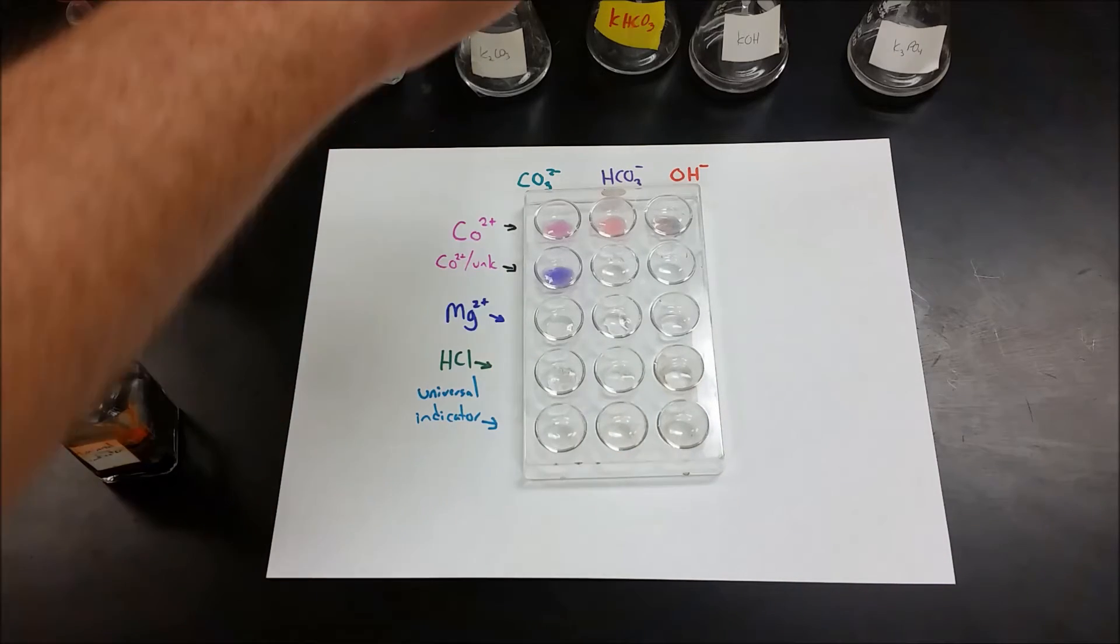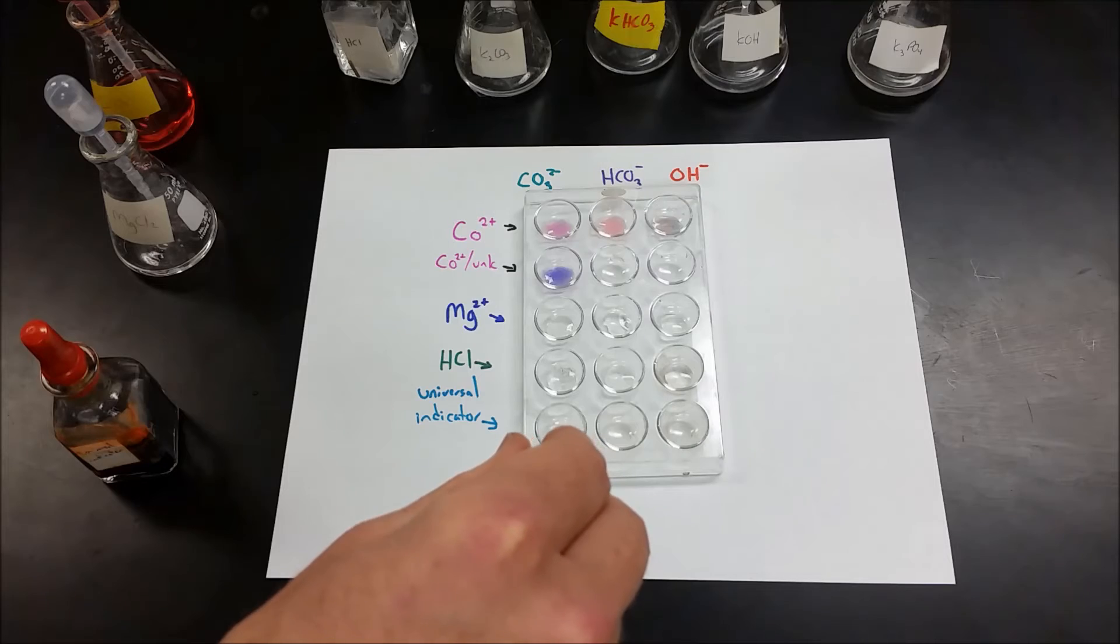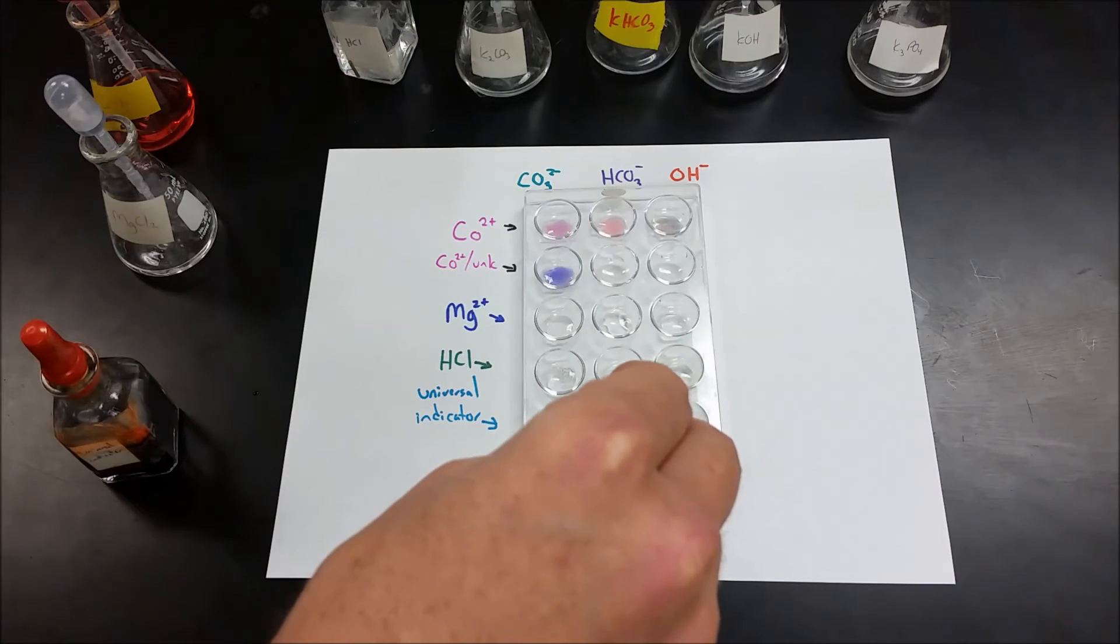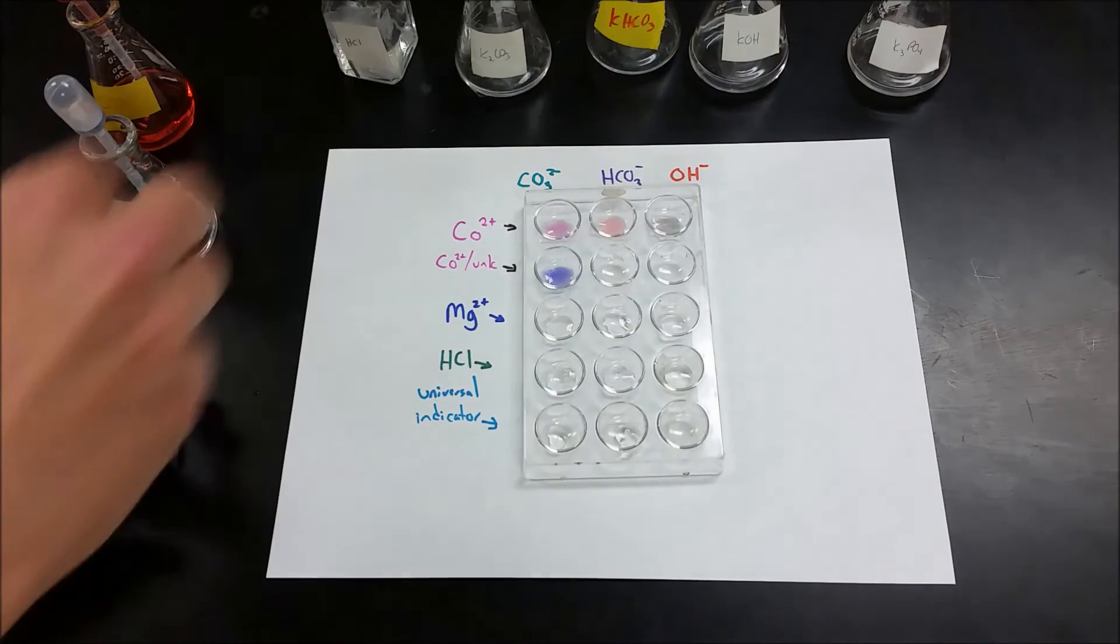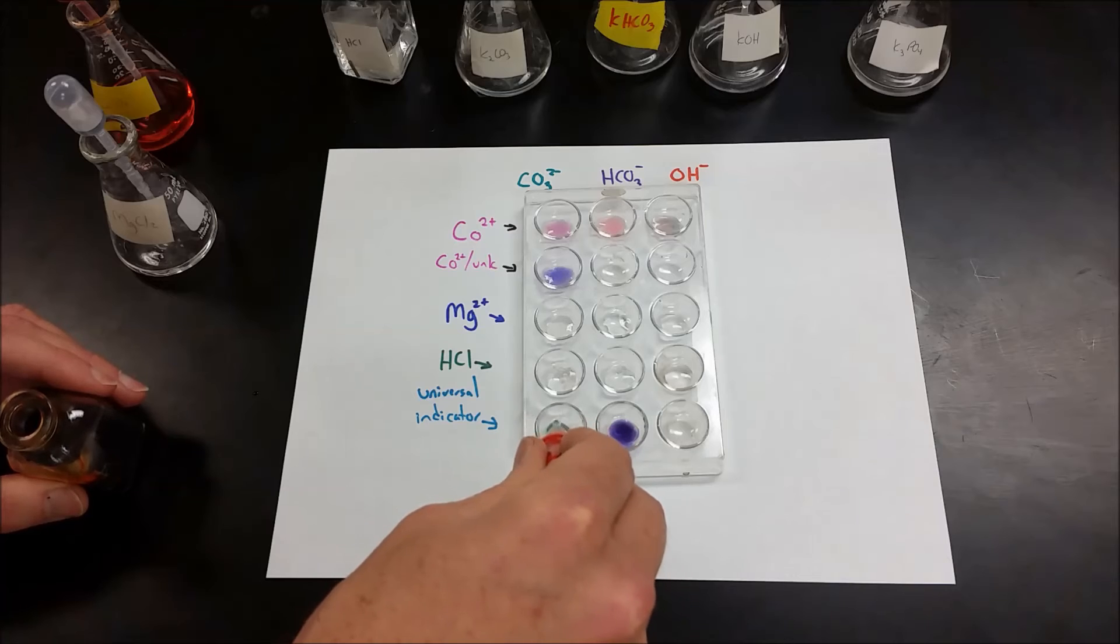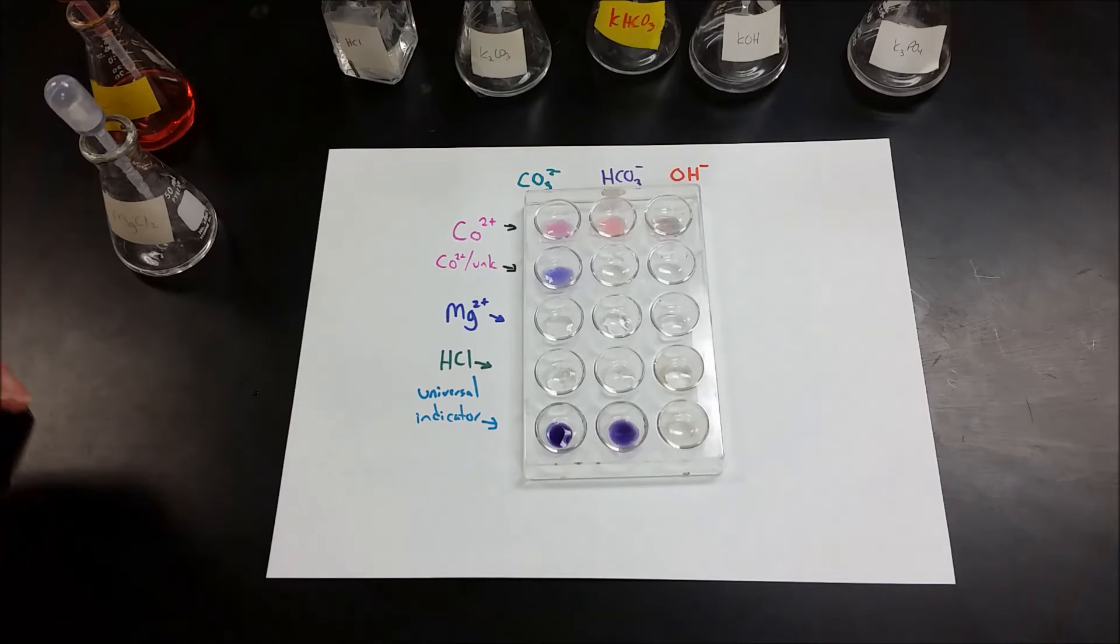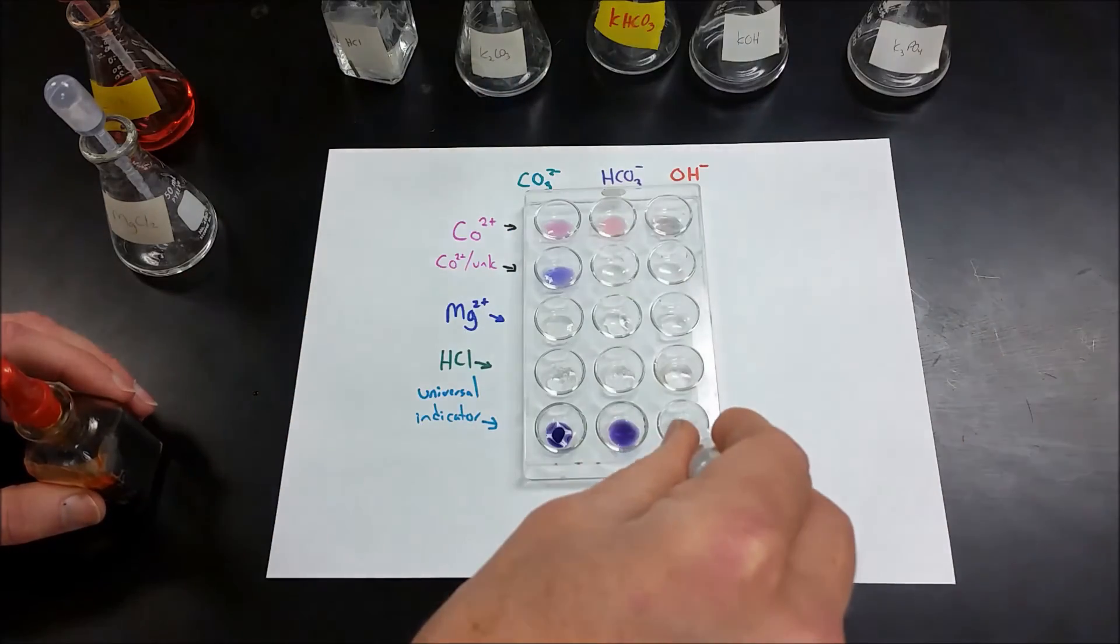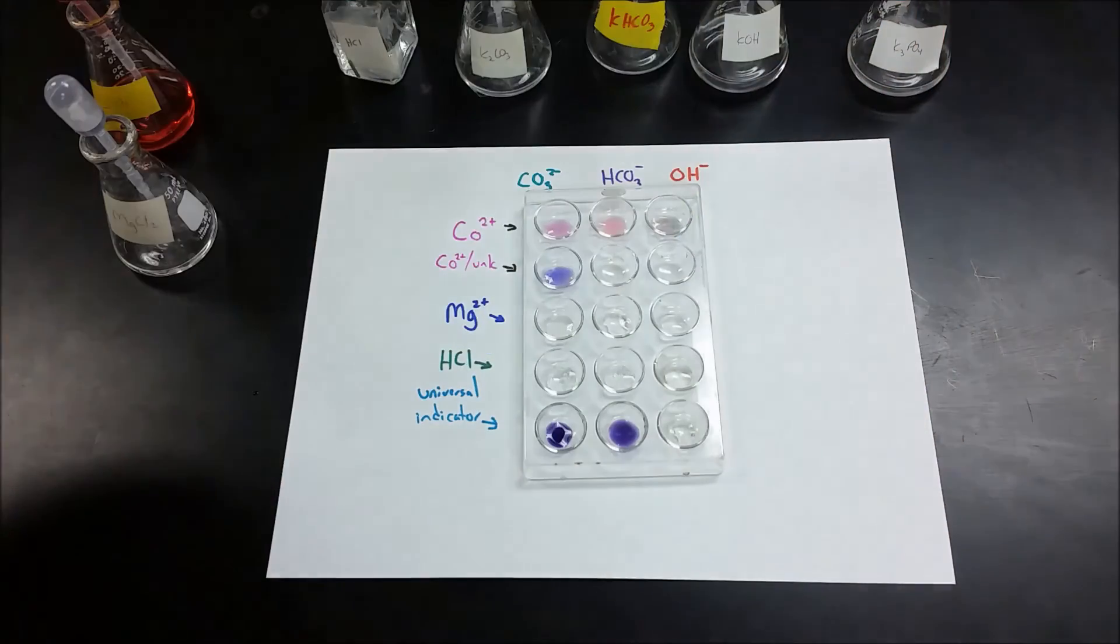And then the last one, we're going to do one more test to tell apart the carbonate and the bicarbonate, and that is adding universal indicator. Sometimes it's just right. The bicarbonate will turn blue and the other will turn purple. Here they look very similar and it'd be really too challenging for me to tell apart. If I did the hydroxide, it would also give me a violet color.